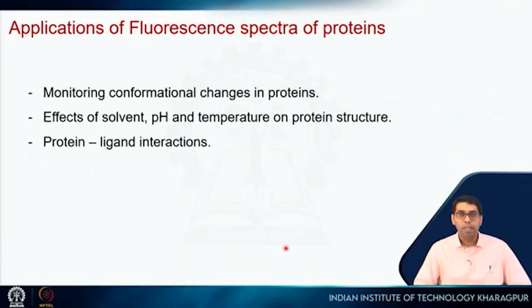So, the application is very similar. You can monitor conformational changes in proteins. For example, if you have a tryptophan which is buried inside the core of a protein, it will have a certain fluorescence, and if it is exposed because of some conformational change, it will have a different fluorescence. So you can observe this change in fluorescence.